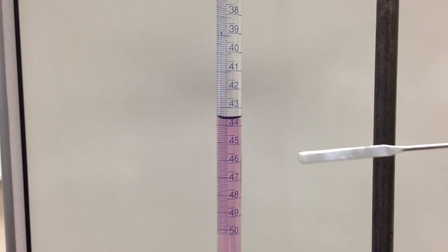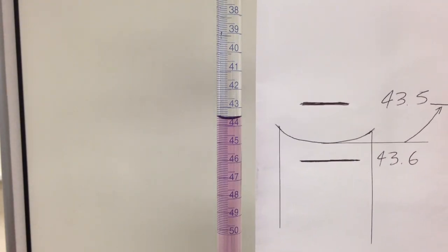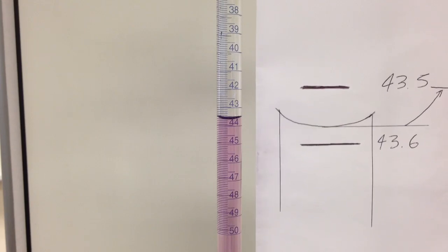Now we take our eye, put it at the level of the meniscus, and we need to estimate our last digit. That will be up to you, the observer.